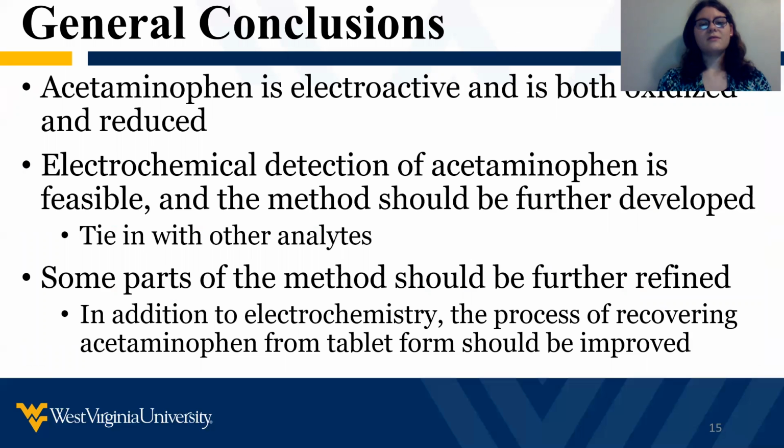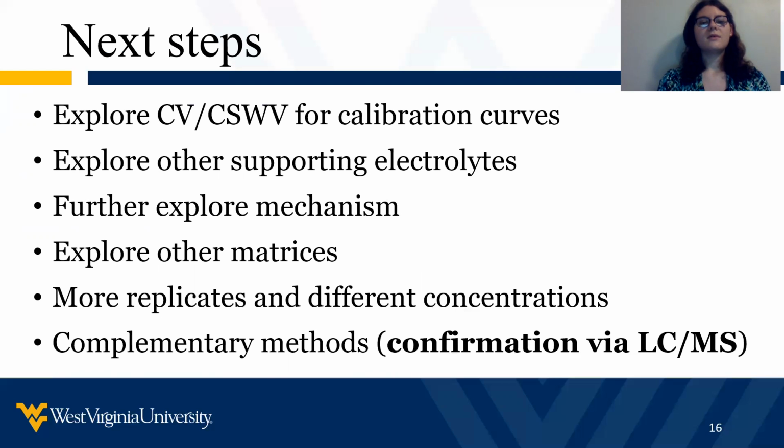For our conclusions, we concluded acetaminophen is electroactive, both oxidized and reduced. So the detection of it is feasible, and our method should be further developed. And we can tie this in with a larger project we've been working on to detect other analytes with electrochemistry and expand the panel. However, some parts of the method should be further refined, and in particular, in addition to working on the electrochemical method itself, the process of actually recovering the acetaminophen from the tablet needs to be improved.